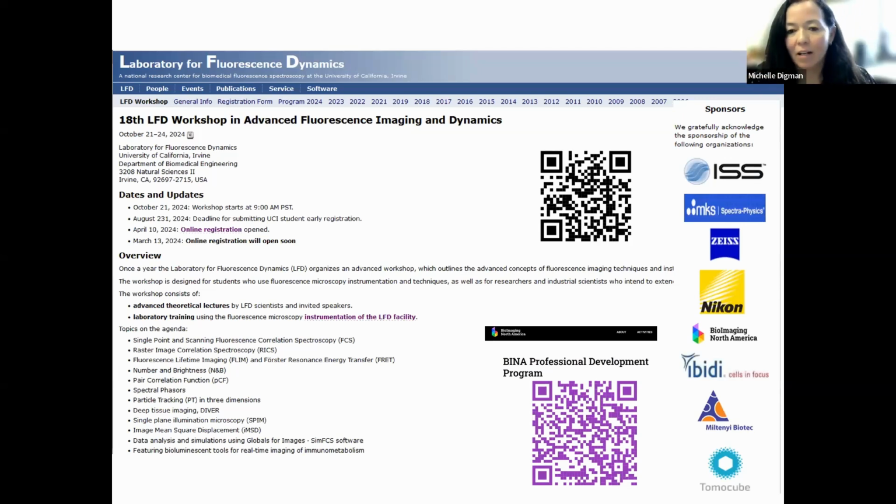We haven't profiled every single type of cell, but we've now looked at neurons, for example, in Alzheimer's disease models, and we do see distinct differences. We're starting now to look at genetic transcription factors that are important for stemness in cancer and in chemo-resistant cells.